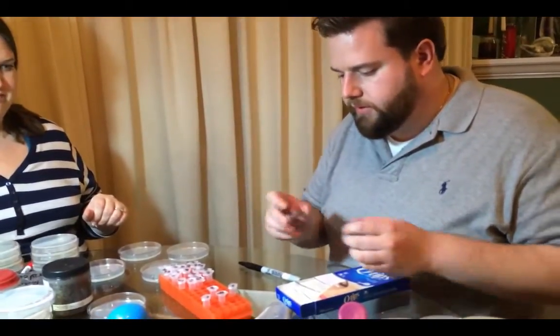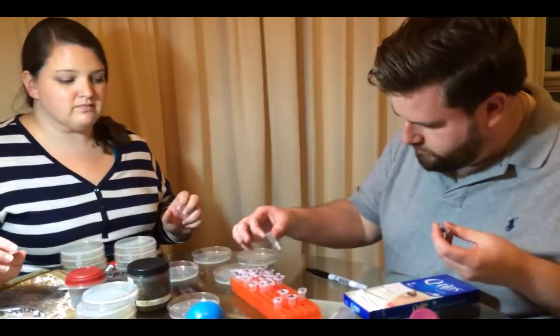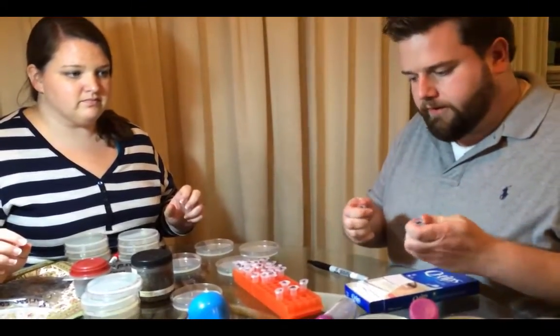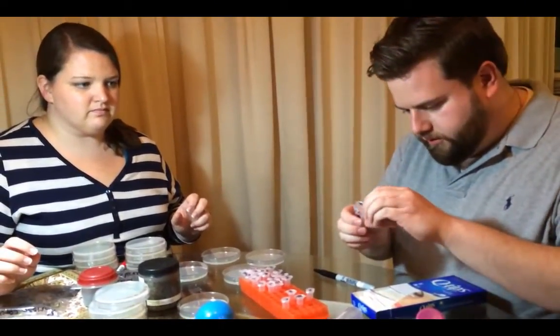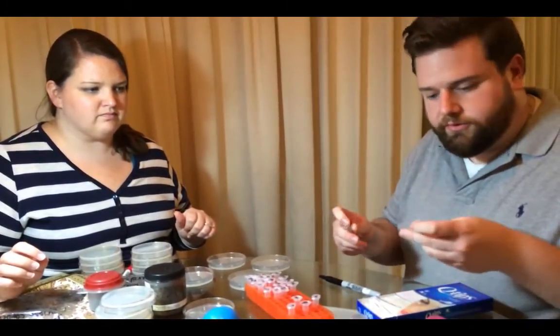I'm going to mix this up. There's actually quite a lot of soil in here, so I think I'm going to dilute it out. I'm going to grab another tube that has saline in it and carefully pour a little bit from this one into that one — so that's about a 10-fold dilution there.